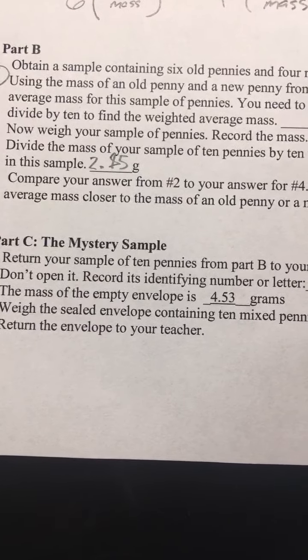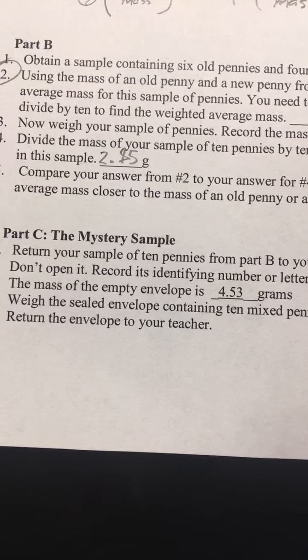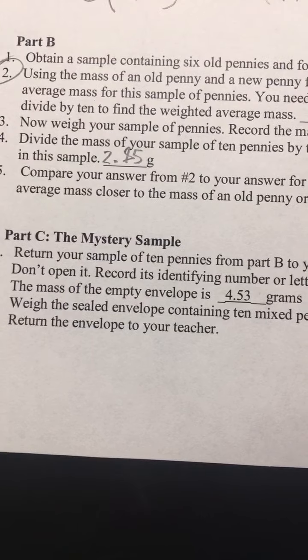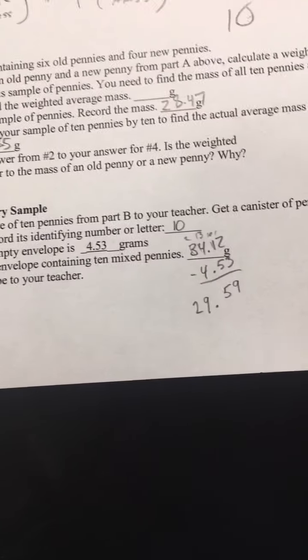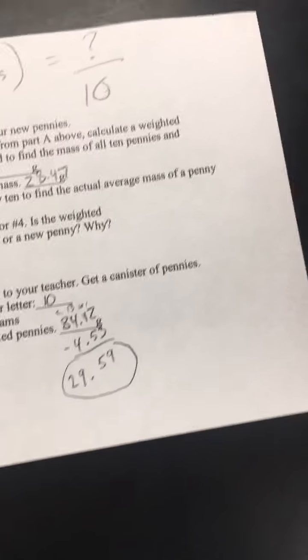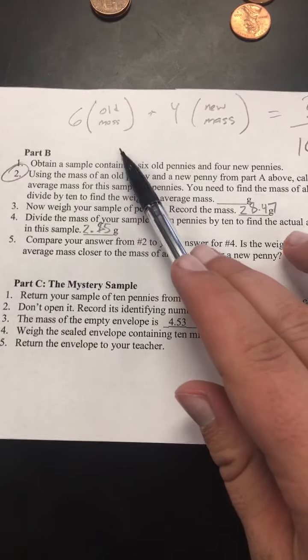I got 29.59. What I want you to see is that this number is greater than the one before, where we had 6 old pennies.